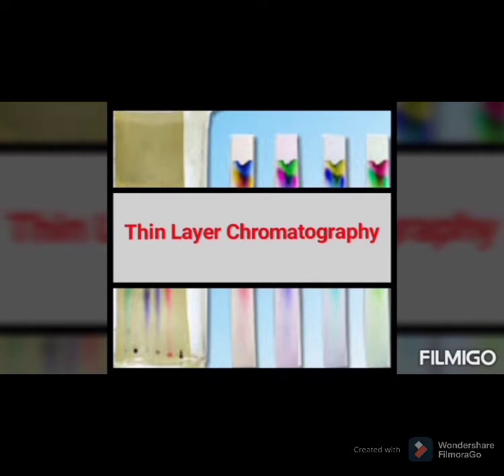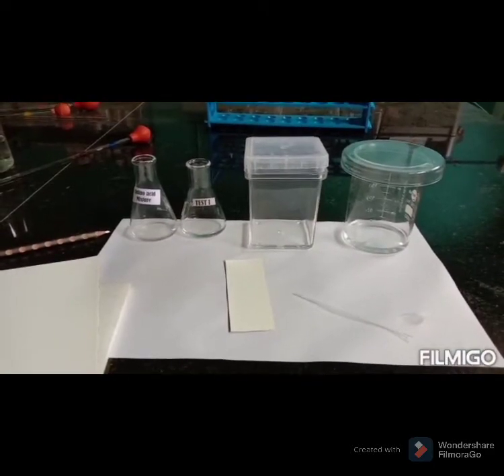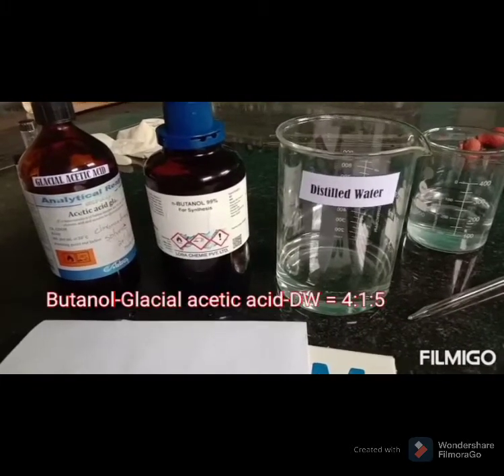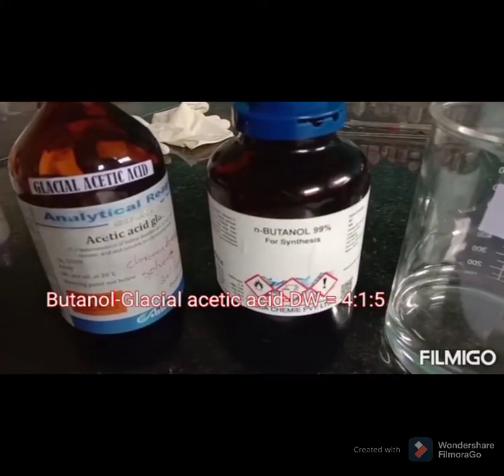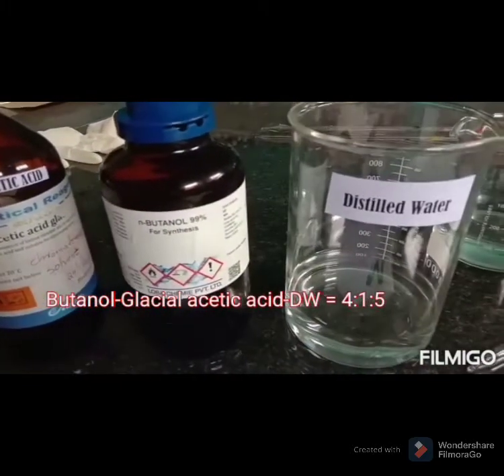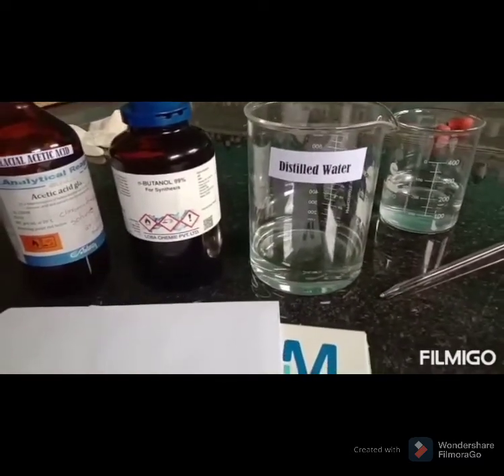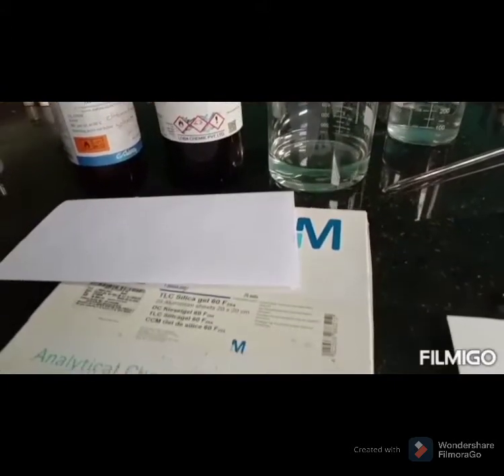The materials required are a clean chromatography chamber in which the mobile phase solvent is to be taken. We are using amino acids as solutes in this experiment, and a popularly used solvent mixture for separation of amino acids is butanol, acetic acid, distilled water mixture in the ratio 4:1:5. The stationary phase used is a thin layer of silica pasted on an aluminium sheet. This is commercially available or can be prepared in the lab also.